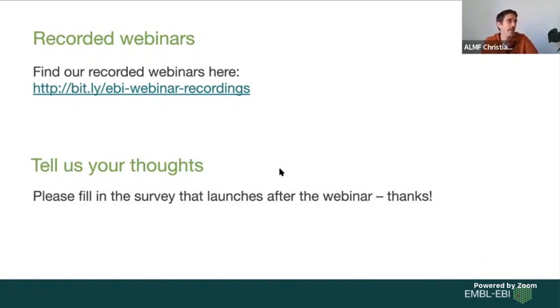You should look if the cells are dimmer where they touch, then you can use this information to draw the dividing line there. If they have the same intensity, then you first do a so-called distance transform on the binary image, and then you split them by shape. Inside CellProfiler, this is also very nicely implemented, so you might want to have a look there. There's a split touching objects option in CellProfiler. So this should be possible, and watershed is the thing you have to look into.